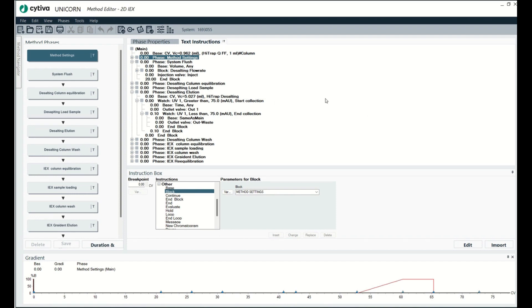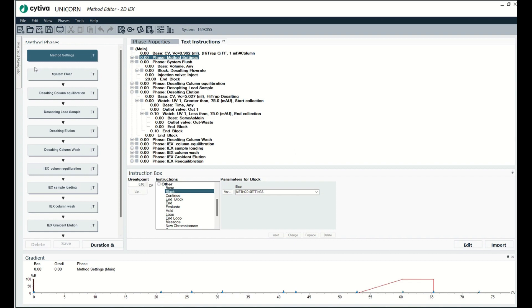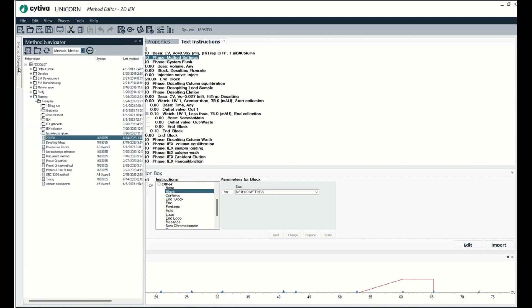Okay, so there is another kind of locked file and that's a file that was previously signed. So let me show you how you sign and by definition then lock the file, and then let me show you what you can do to get around that. You're not really unlocking it. You're more just deleting the old one and saving a new file.